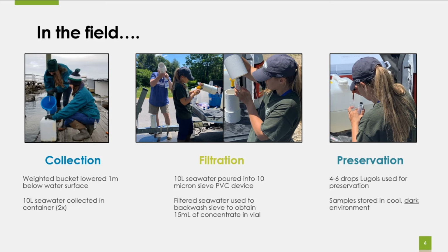I'm doing here. And then one of the most important parts is that we need to preserve it with Lugols. The other preservatives you can use, Lugols is the easiest for us to use. It's not really that toxic. It does stain, though, I will say that. If you ever use it, it's iodine. I'm sure you may be familiar with it.